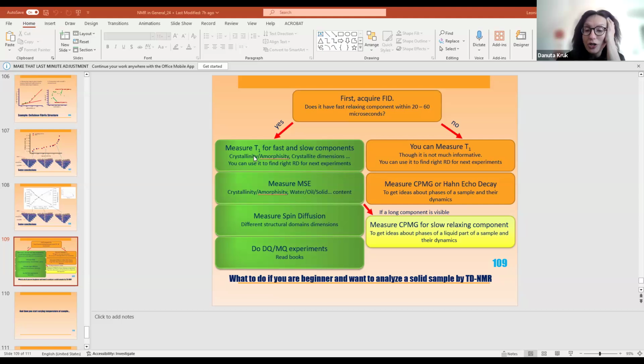I know that T1 in both cases is single exponential for hydrogen and for fluorine. However, we are talking now about T2. And T2, as far as I remember, is not single exponential. Could you confirm or deny?